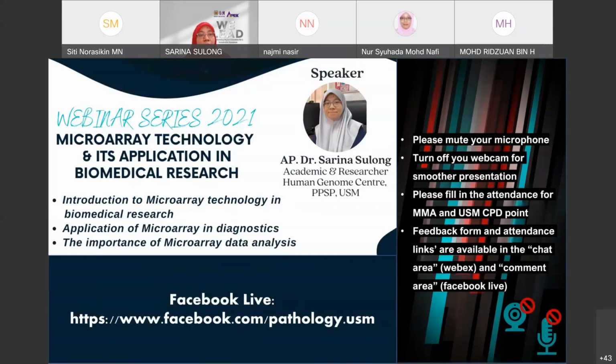And because it's very big data, if you use a very high density array, or the high density of the NGS platform, of course the data will be very big data compared to the targeted approach.